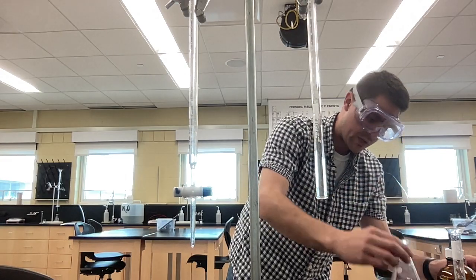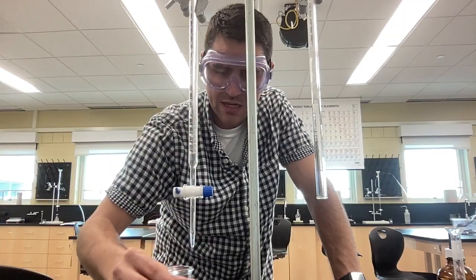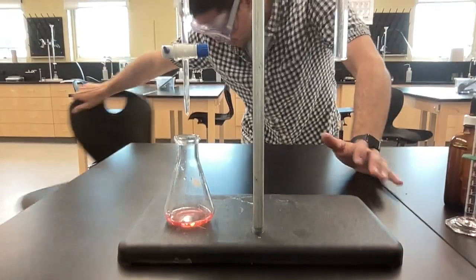It turns green when it's neutral, and it turns blue when it's basic. So now you see it's red. This is indicating to me that it is acidic.